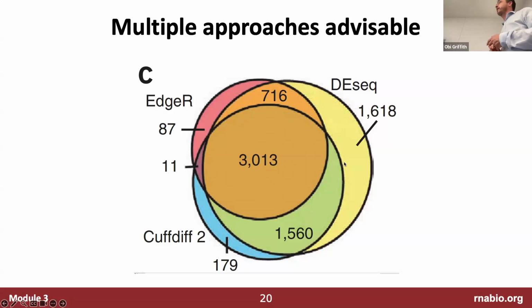Depending on your downstream steps, you may want to be more permissive and take the union of multiple approaches, right? Like if a gene is identified as differentially expressed by both DESeq2 and Ballgown, maybe we include them either way. Or maybe you want to be really strict and say, I have very limited resources to validate some of these candidates, so I'm just going to go with things I'm most confident in that came out as significant by 2 or 3 different approaches.